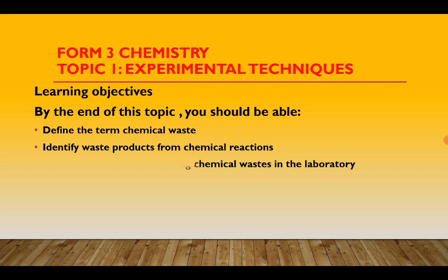Also, you should be able to describe safe ways of disposing chemical wastes in the lab. When wastes are generated in the chemistry lab, you don't just heap them up. Otherwise, the lab will be a very dangerous place to work in.